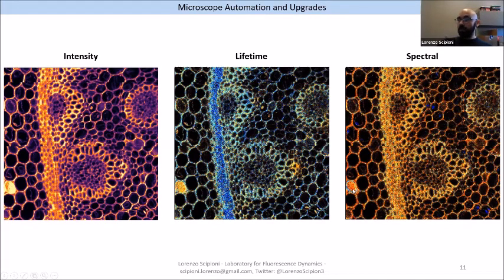So that's very useful for classification, because that's why I call it multidimensional microscopy, because it gives you more layers of information than simple fluorescence intensity. Now, this is blind. Let's say we just look at the things. It has pretty colors, so we're happy with it. But we can also do something more in depth. For instance, we developed on this base a method for doing blind unmixing of both spectral and lifetime information.